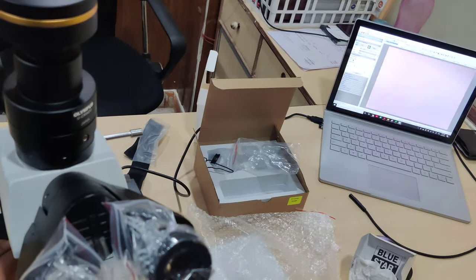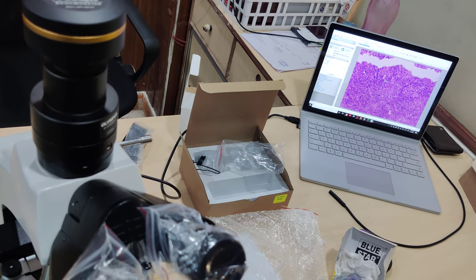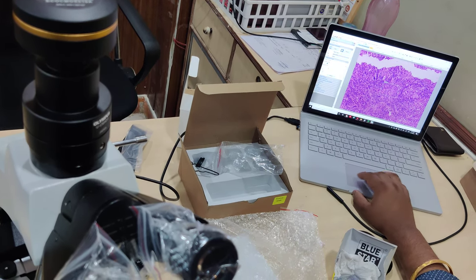Once this gets focused, you are able to view beautifully on the screen with the help of the monitor. You can take the snaps and then you are good to go.